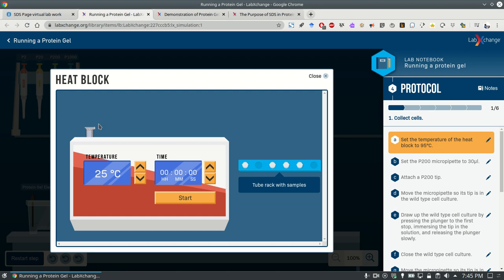All right. Now the heater, you can change the temperature of the heater when it's time to do that, and you can change the time. If you hold the arrow button down with your mouse button, you can make the time move faster. Right? Start and stop. Oh, okay. I don't know how to stop it. So how do you know when this is done? You know it's done when the time is back to 0. So you set the time to whatever you thought it should be set to, as it says in here, and then you'll press start, and then very rapidly the time will go down to 0. Let's say you put 5 hours here. It will take like 30 seconds for 5 hours to go by.